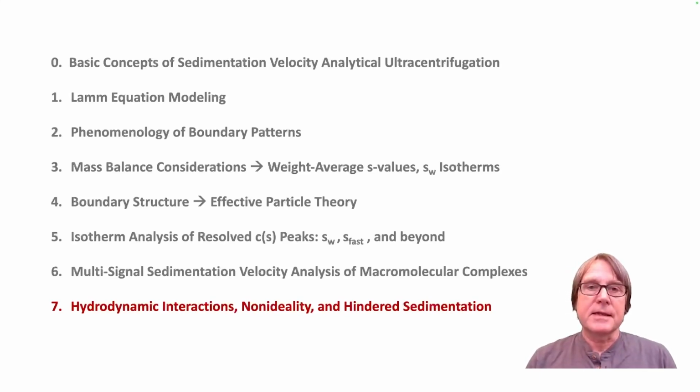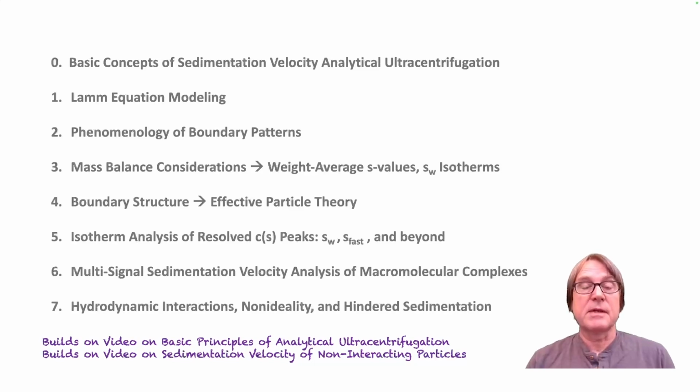This is a long presentation, but the advantage of a video instead of a live lecture is, of course, you can pause it at any time. For example, since the material builds on foundations described previously in this series, we will show references to other videos that you can consult if you wish before continuing. Up front, if you're unfamiliar with sedimentation velocity, I would recommend to start with these two videos. Likewise, you may pause the video to carry out some practical exercises using data and software provided through the workshop.